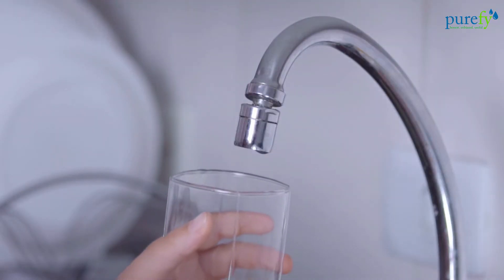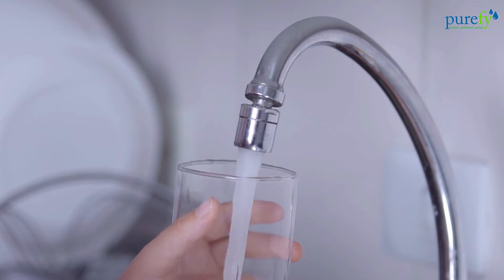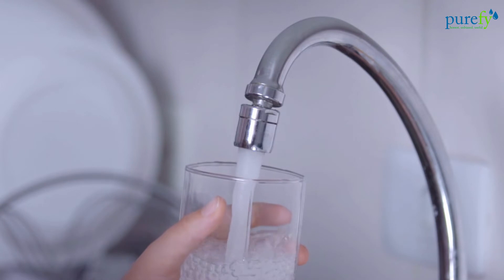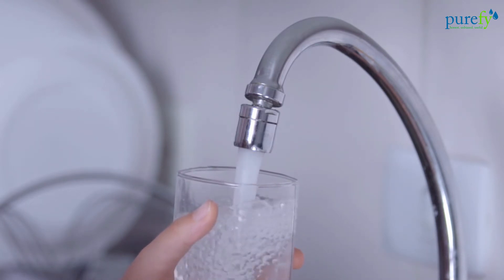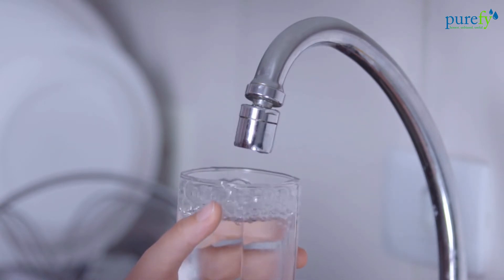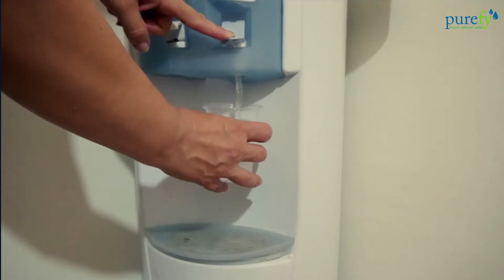That's quite high. Considering the fact that it is borewell water, we knew the TDS level would be high. But frankly speaking, we are a little surprised to see such a high reading — we expected the water supply TDS to be around 600 to 700 ppm. This water is definitely not fit for drinking. For water with a TDS level higher than 500, you need an RO purifier.